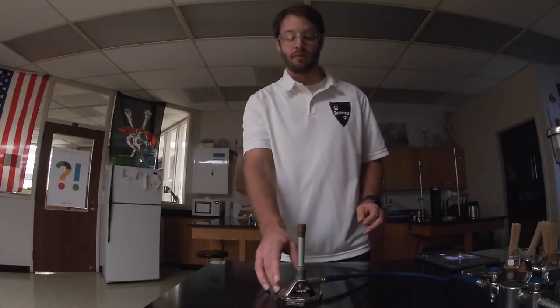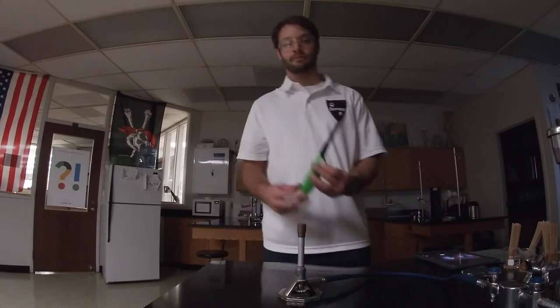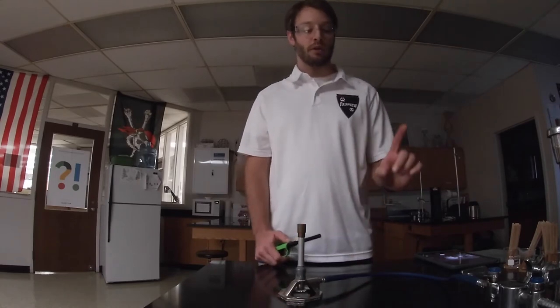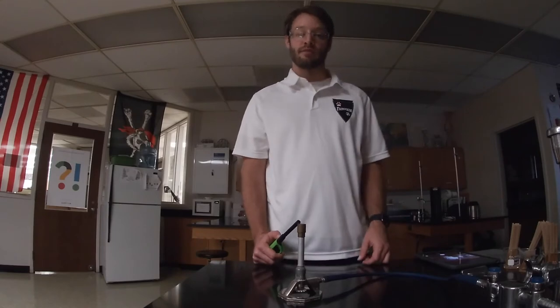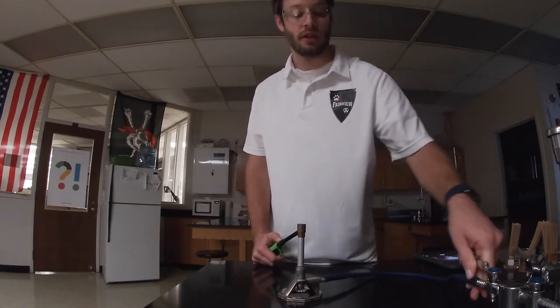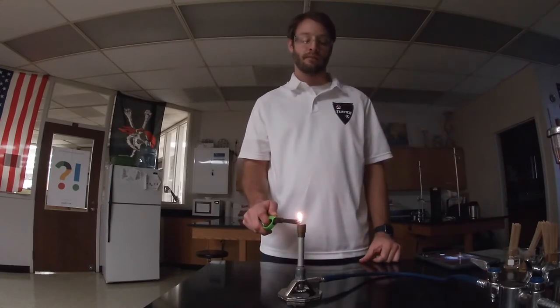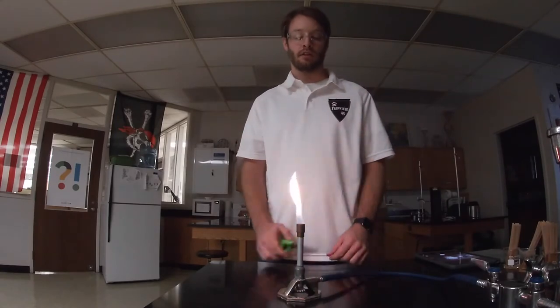To ignite the burner, you need some type of ignition source — I'm going to use a stick lighter. I've already turned the valve on the bottom a half turn, so I turn on the gas at the source and light it at the top.